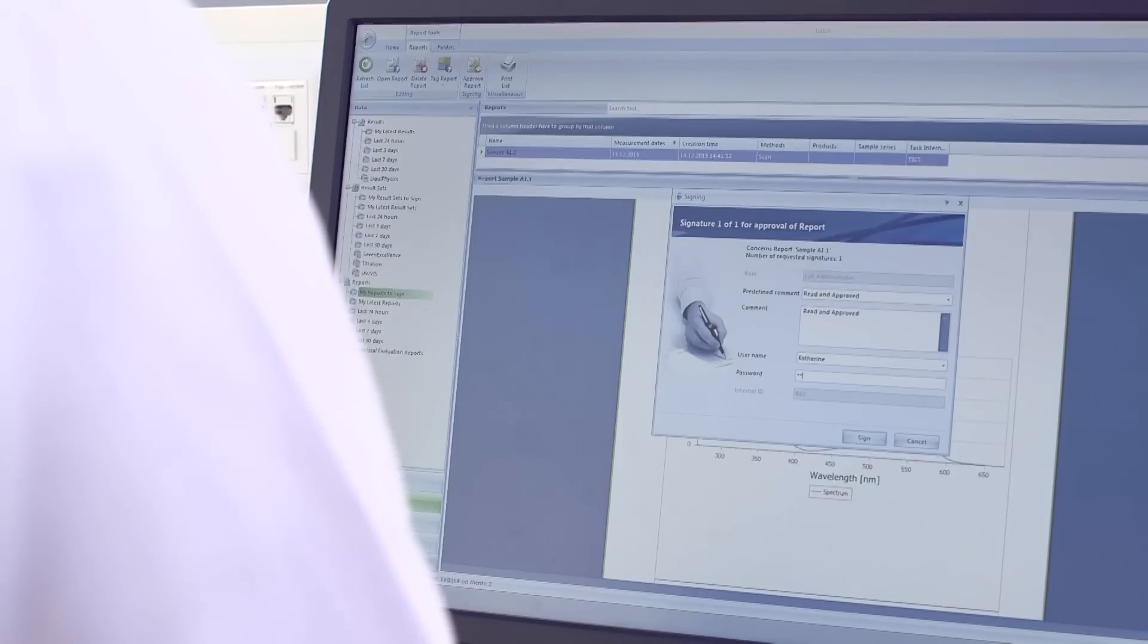The titration excellence line is modular, efficient, simple and secure.